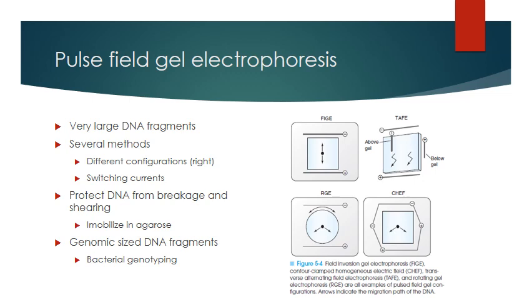but then once you have it immobilized, remember, you're going to have a piece of DNA immobilized in this agarose plug before you are even close to PCR, okay, before you've even gotten to there.